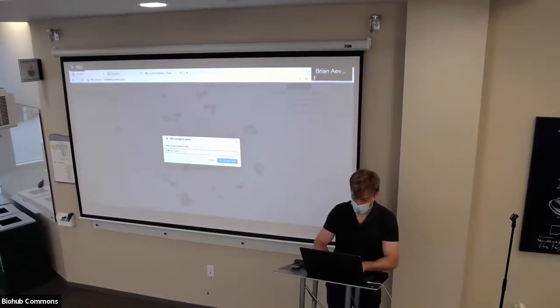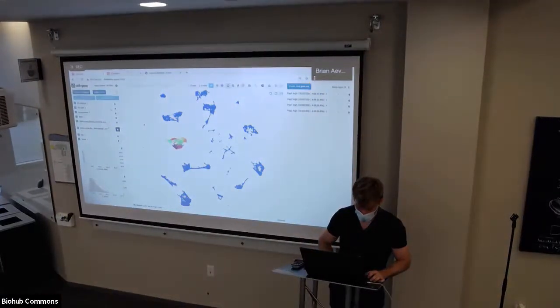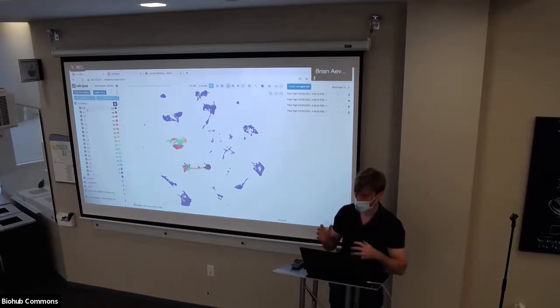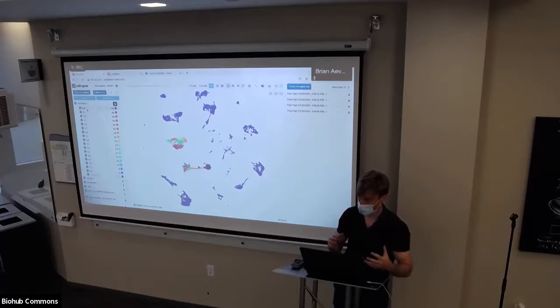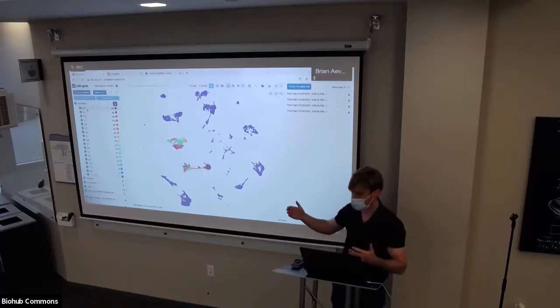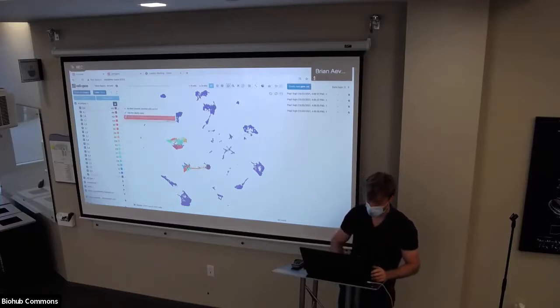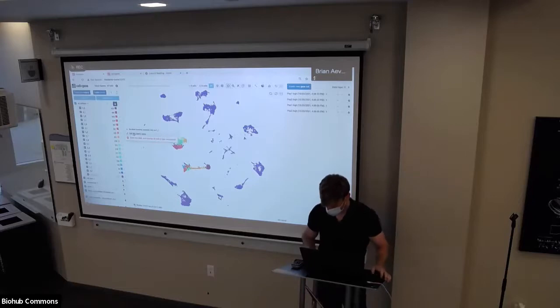All cell types. And then you can color by it. And now you've combined them all. The names, in order to avoid conflicts, I add an _0, _1 based on which label it came from. It starts from 0, goes up to the number of labels you're trying to fuse. But in the end, you'd manually relabel all of these anyway. So yeah, that's fusing labels.